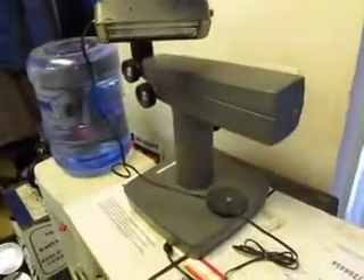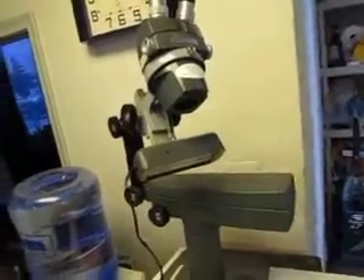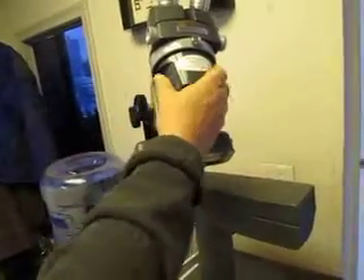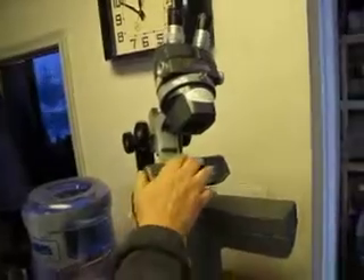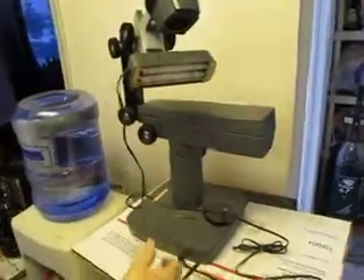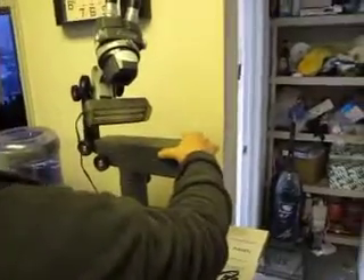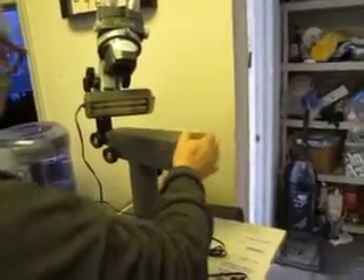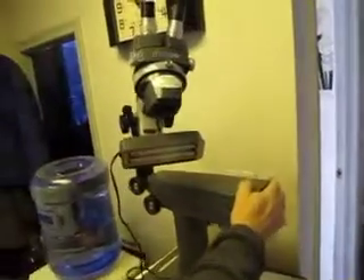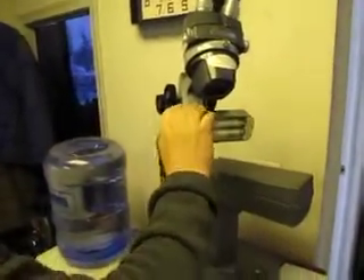It looks like it's got about a 75-pound shipping weight. We would have to take the camera off and pack it separately, but we have shipped delicate objects before and have good experience packing them, so you would be getting it in good shape. This came out of a state police crime lab.